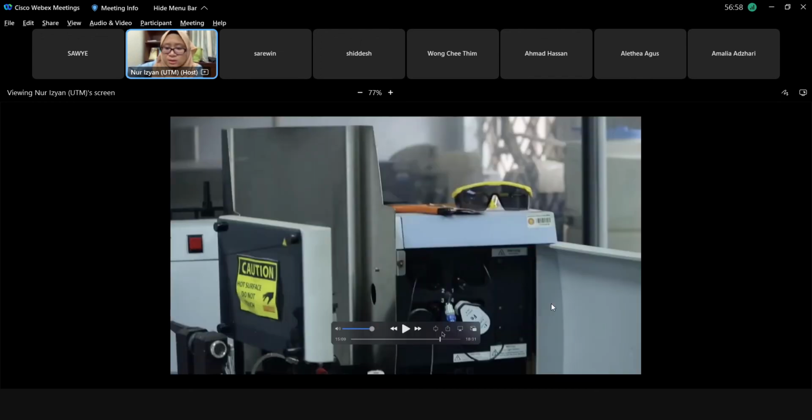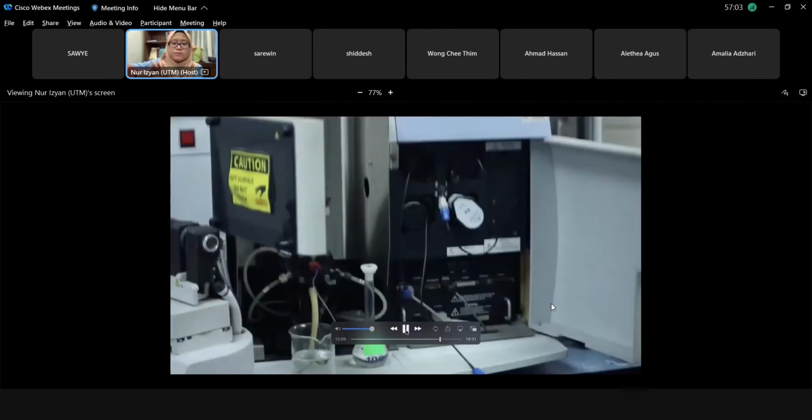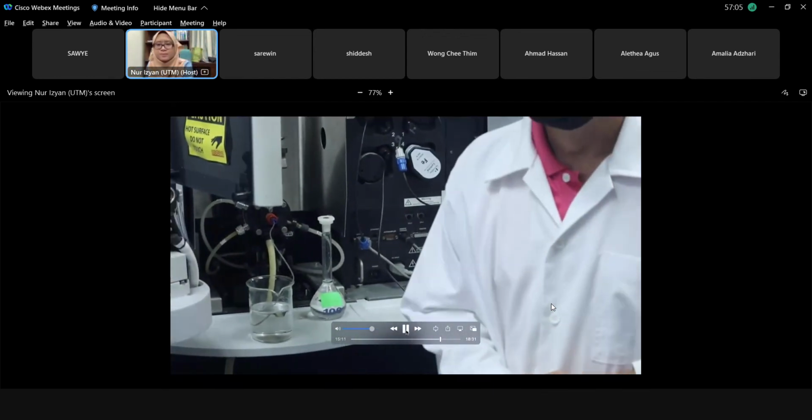Okay, so we have a few more for this video.